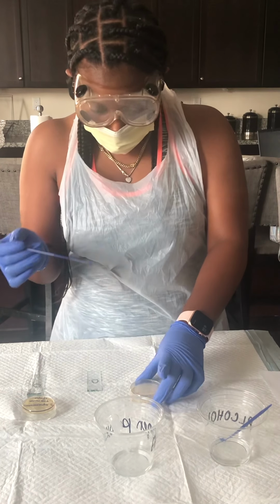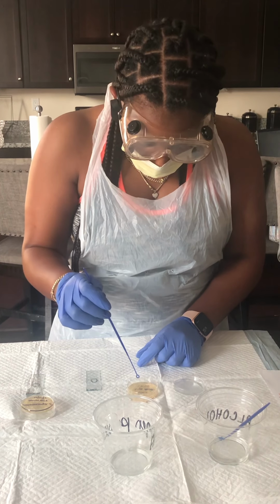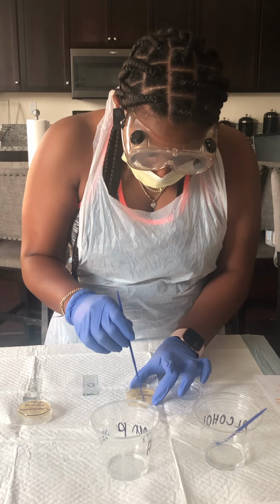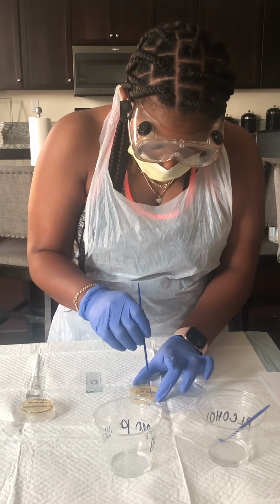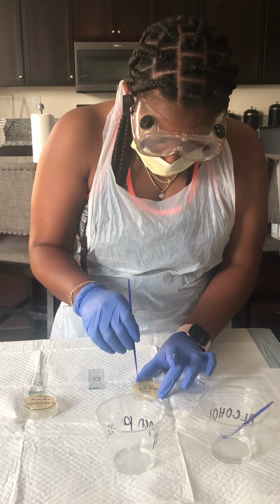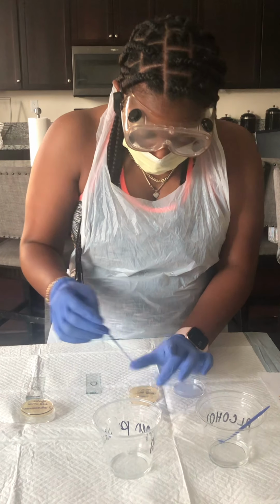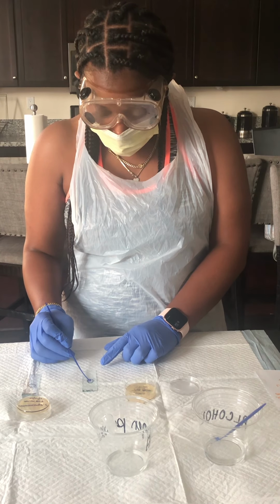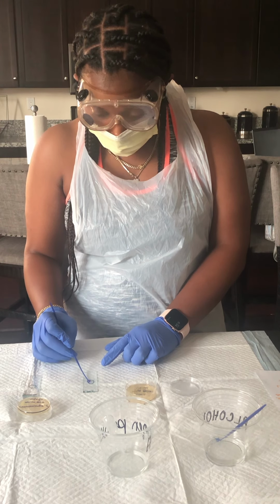So we're gonna take our cap off of our plates, we are going to get a sample of our agar from our agar plates. And we are going to place the sample right into the center of our slide here.